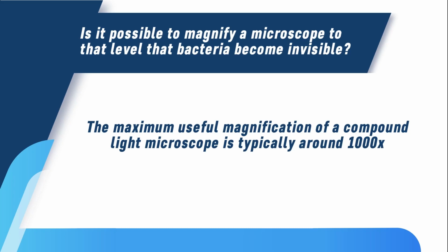Therefore, when using a light microscope, it is important to select an appropriate magnification level within its range that allows for clear observation of bacteria while considering the resolving power of the microscope and the size of the bacteria you are studying.